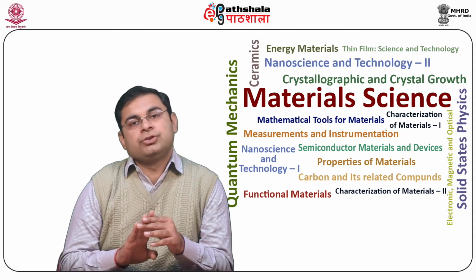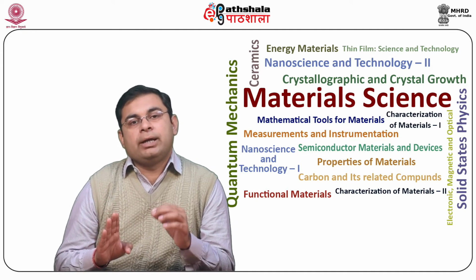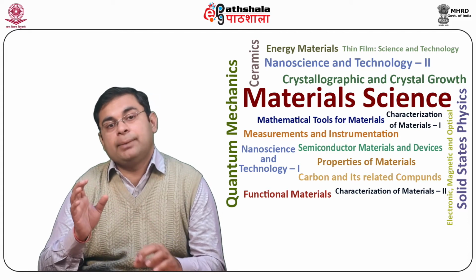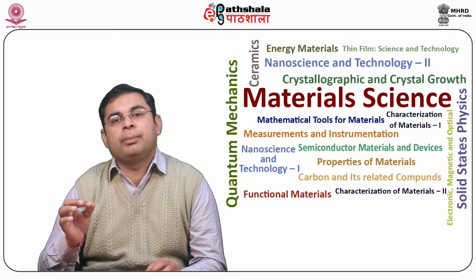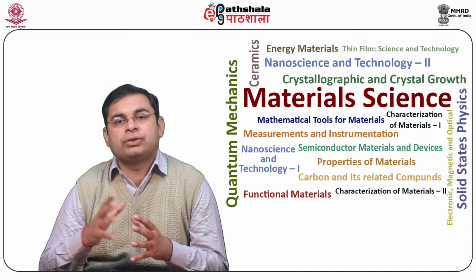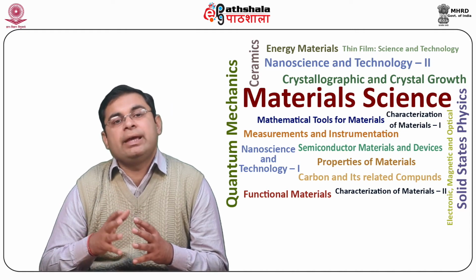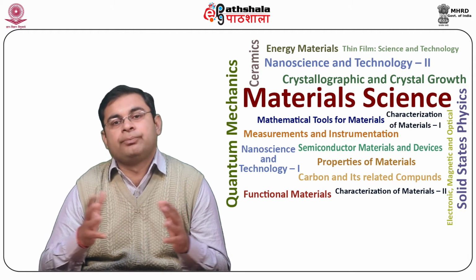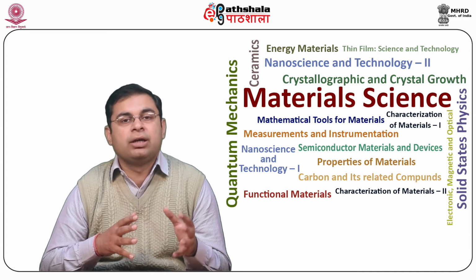The lateral resolution of Auger spectroscopy is less than 100 angstrom and is much better than XPS. Thus, nanostructures can be readily imaged, along with creating a 2D map of elemental composition of the surface via scanning Auger spectroscopy, that is SAM. AES is a rather fast technique, despite being an expensive and sophisticated technique.